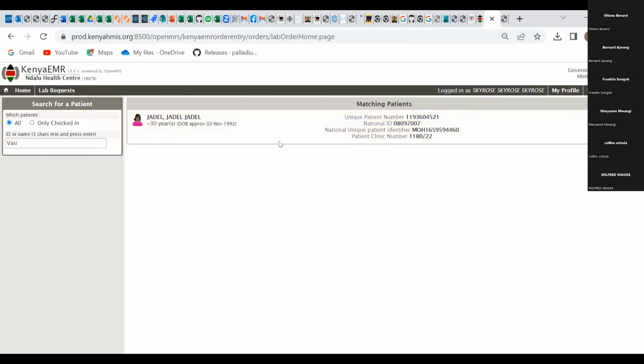Sorry, I'm randomly searching for a patient. You can use Jadel as our patient.